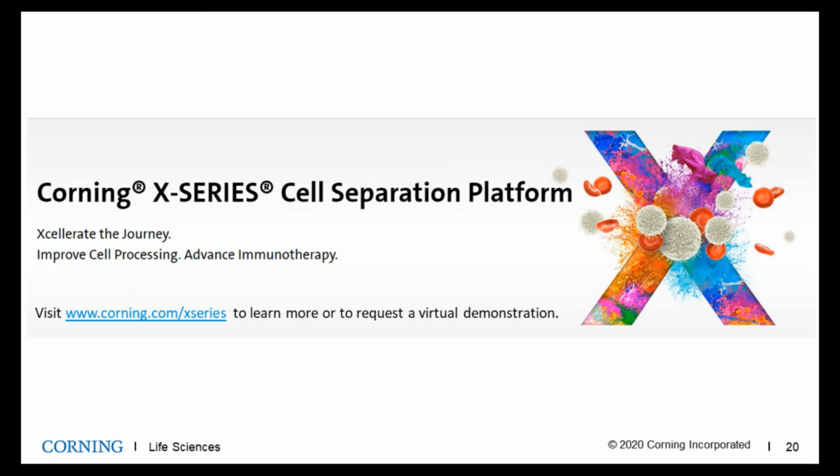However, as I showed you the parameters in that control module with the tower of optical sensors and the accelerometer and the cams, that really gives a high degree of flexibility in how you want to control the movement of those cells through the cartridge.